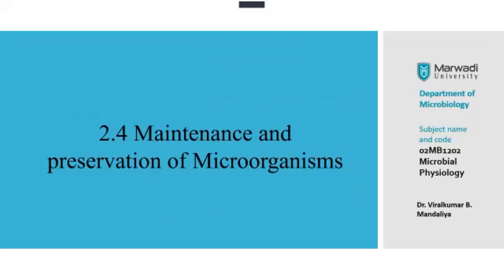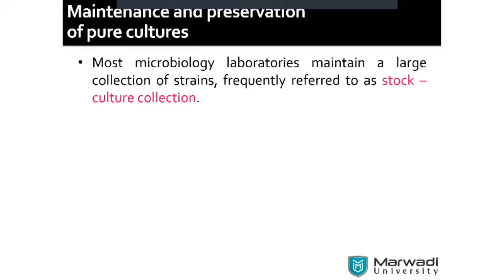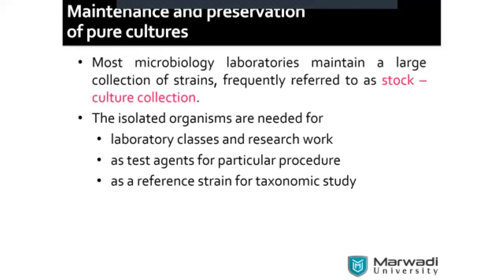So we are looking to move to the next remaining topic in this unit: preservation. As you are doing some cultures, we need to go for preserving the bacterial suspension, fungal, or any microbial suspensions. There are several basic techniques for maintenance and preservation. What is the first part?